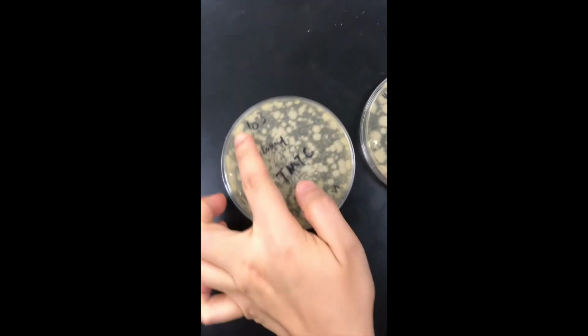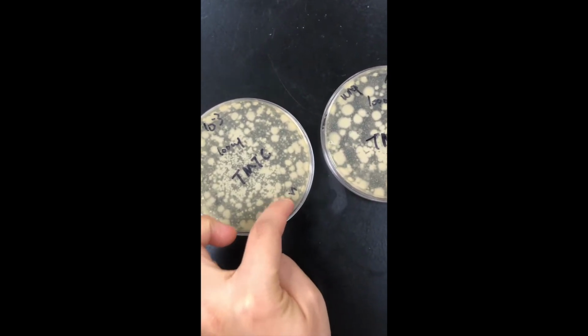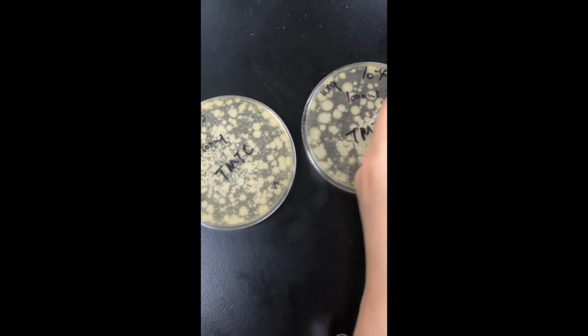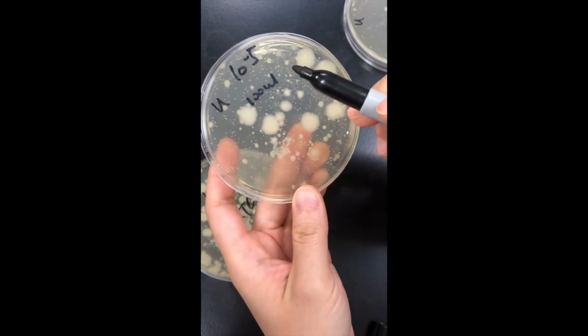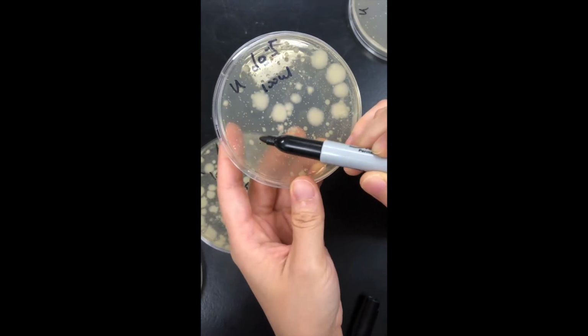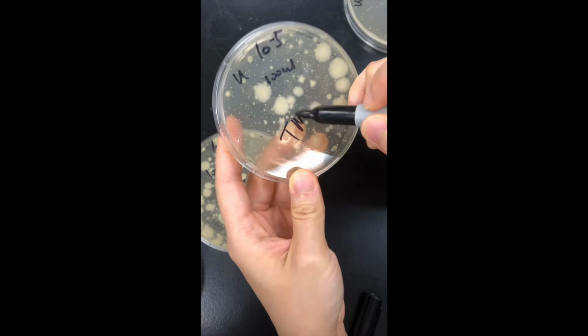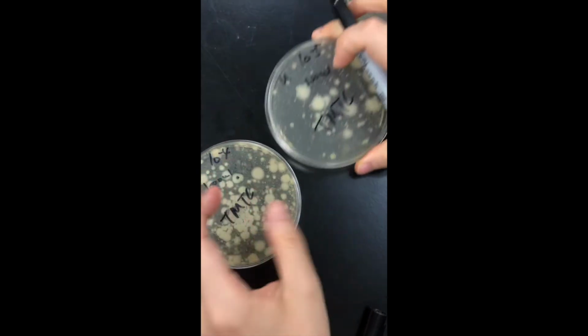10 to the minus 5, this is unpasteurized. Yes, they are all as shown here. These are all unpasteurized raw milk samples. And for this one, it's the same. There are so many little dots, more than 300, I guess. Yes, more than 300, too many to count.